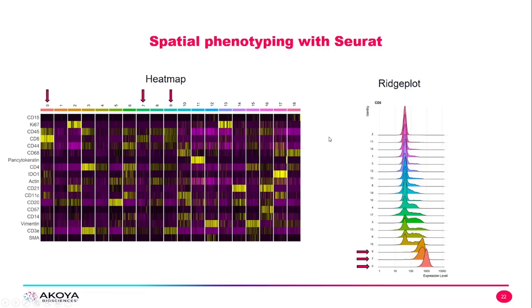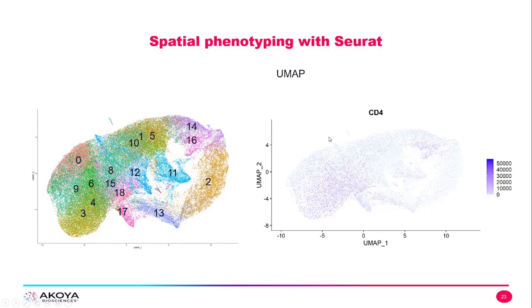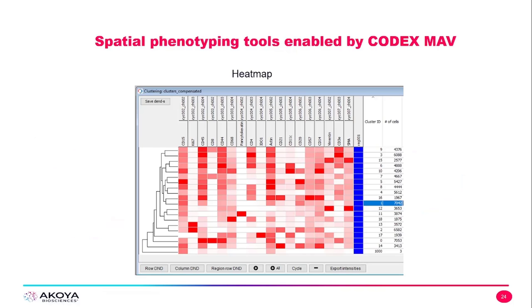We can also leverage the UMAP to see what these phenotypes might be. If we can't determine from the heat map and ridge plot alone, we can look to the UMAP to see our different populations. In this case, we have CD4 expressed on the left-hand side of the UMAP, so we would expect clusters 3 and 4 to be CD4 populations. Inside of CODEX MAV, we also have another heat map with a dendrogram on the left-hand side, where bright red is high intensity and white is low intensity for each target marker per cluster.